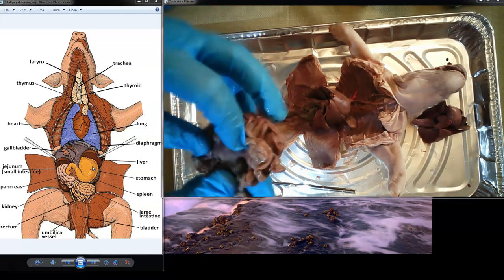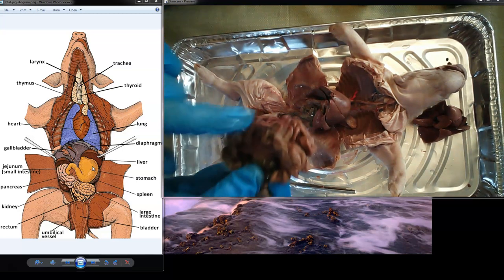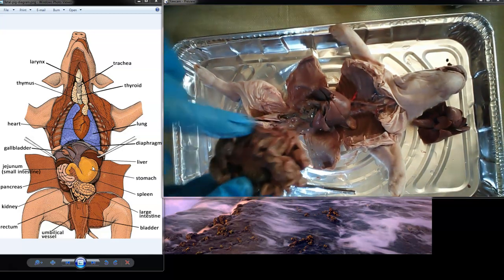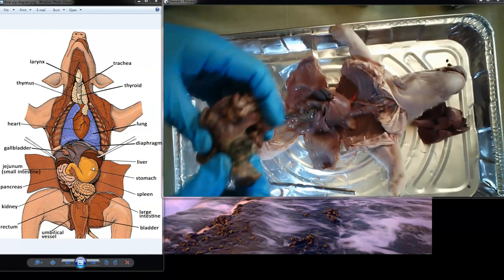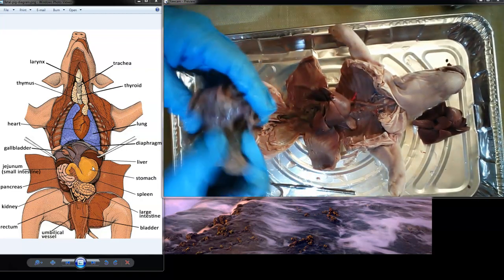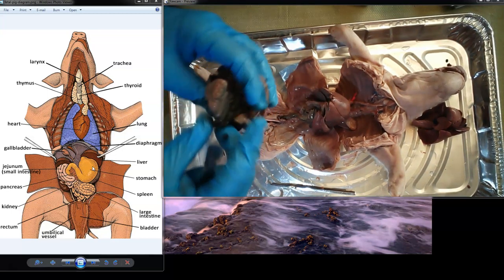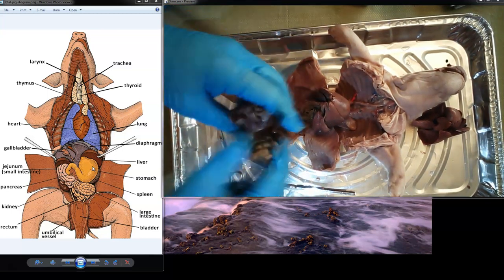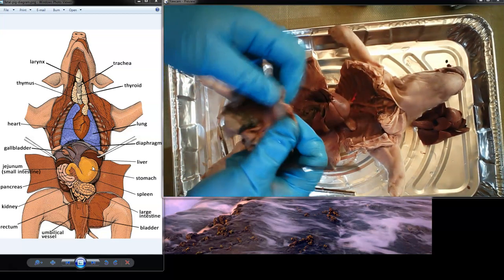It's connected to this big lump in the middle. So this is where all of the blood goes back and forth from the intestines, and then it moves through the bloodstream, and you get all of the good stuff from your food all around your body. If it stayed in your intestines, it wouldn't do any good. If you got rid of it after you ate, it wouldn't do any good. So it stays in your body, but it moves into the bloodstream.